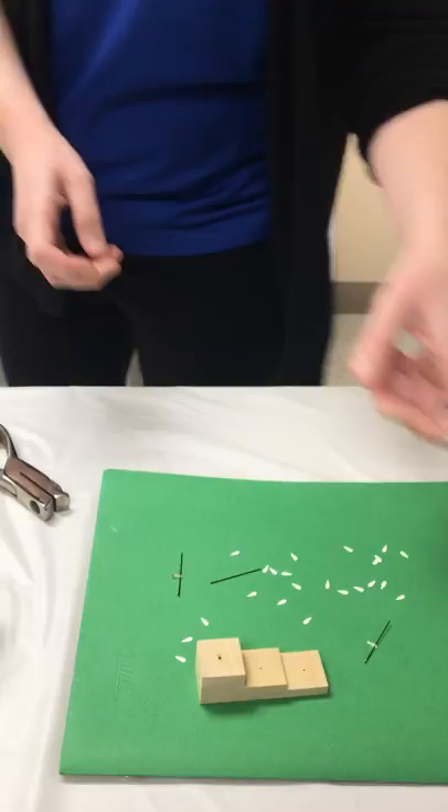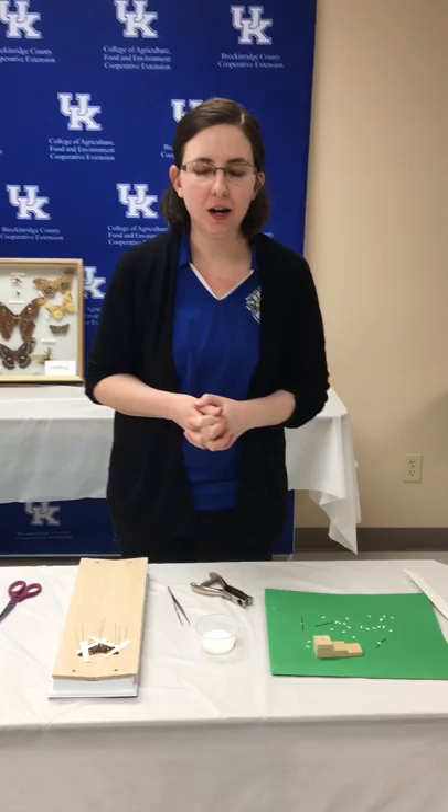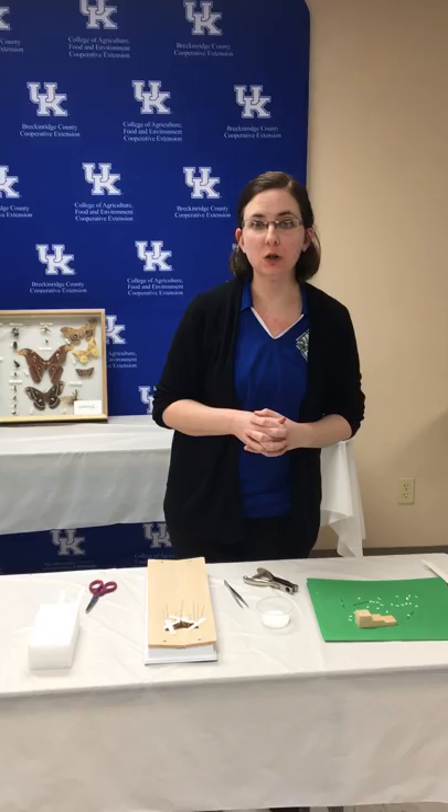That sums up the different ways you can pin insects. The UK entomology guide that was mailed to everyone goes into more detail, so if you have any questions or catch an insect not covered here and want to know how to pin it, feel free to check out that guide or call the extension office. Happy pinning!